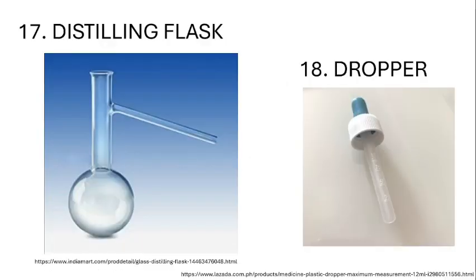Next, we have the distilling flask. As I have mentioned earlier, this will be part of the distillation setup, and this side arm here is connected to your condenser.